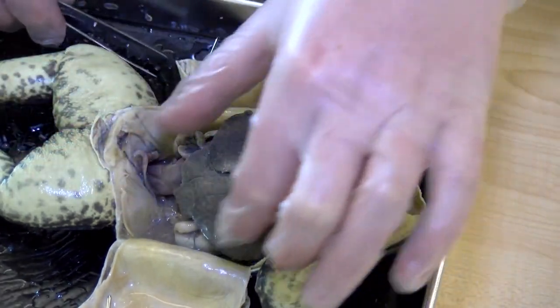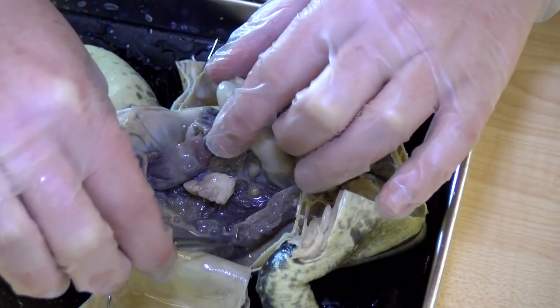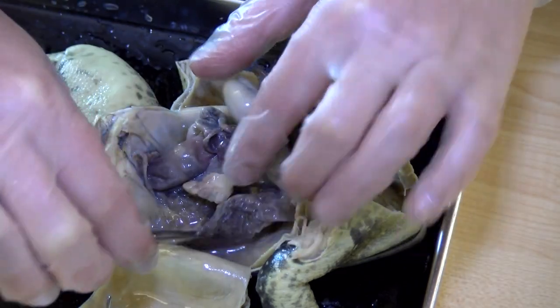Towards the back, if we flip this up again, you can see here — it's deflated — but this is one of the frog's lungs.